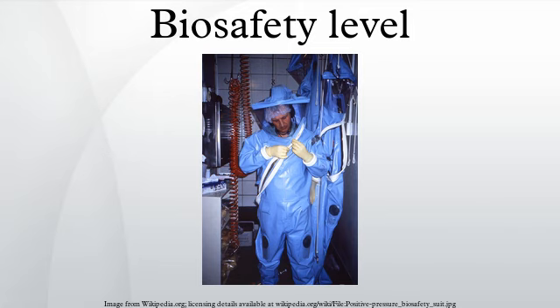exist, such as Yersinia pestis, Francisella tularensis, Leishmania donovani, Mycobacterium tuberculosis, Chlamydia psittaci, Venezuelan equine encephalitis virus, Eastern equine encephalitis virus, SARS coronavirus, Coxiella burnetii, Rift Valley fever virus, Rickettsia, several species of Brucella, rabies virus, Chikungunya, yellow fever virus, and West Nile virus. Laboratory personnel have specific training in handling pathogenic and potentially lethal agents, and are supervised by competent scientists who are experienced in working with these agents. This is considered a neutral or warm zone.